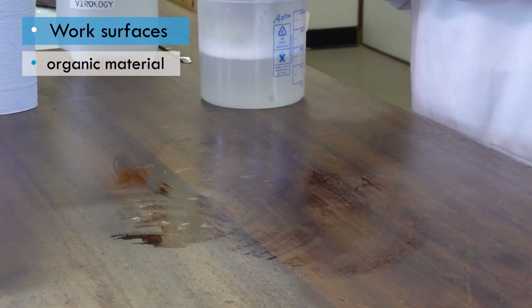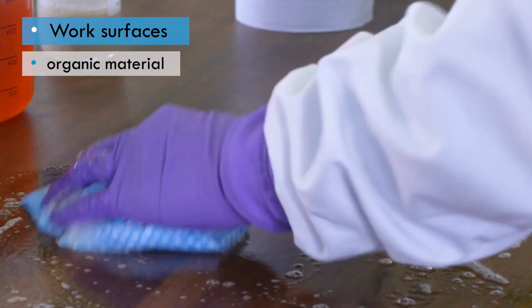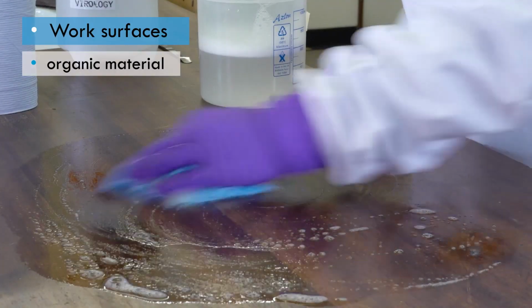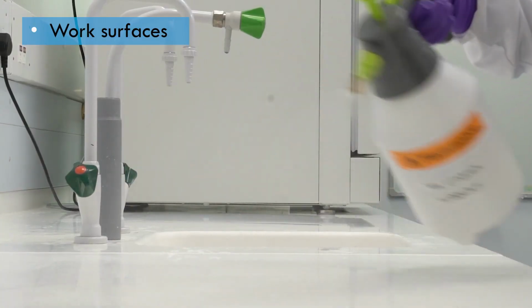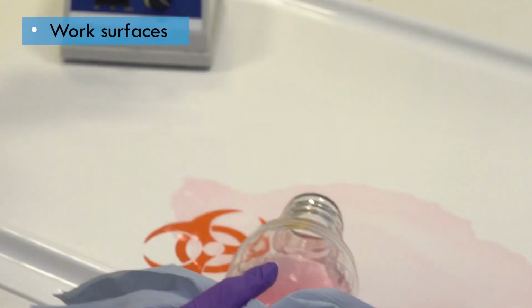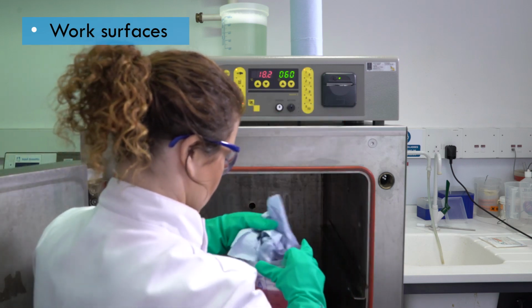If there is organic material or dried residue on the surface, it should be cleaned with warm soapy water to avoid inactivation of the disinfectant from high loads of organic material. Disinfectant can be applied to a surface either from a spray bottle, by pouring it carefully, or by transferring it to a disposable tissue or a cloth for wiping.